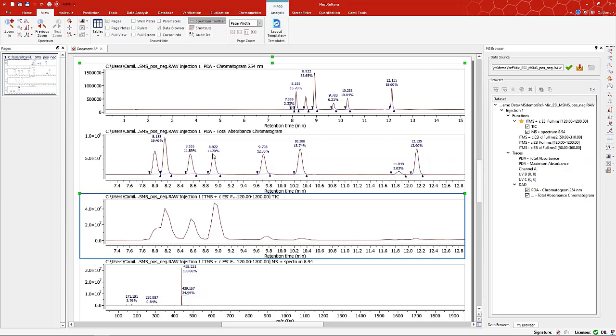So let's arrange this in a manner that we'd like to see it if I'm looking at a reaction monitoring. Let's say I've just ran a reaction, injected the sample in the mass spec, and I want it organized in a certain way. Typically, what I've done in the past when I worked in pharma is I had the UV spectrum at the top, and then I've extracted the spectra for multiple peaks on the bottom on one page with a positive, and then I've had another page where I had the negative spectra. So let's try to do that manually.